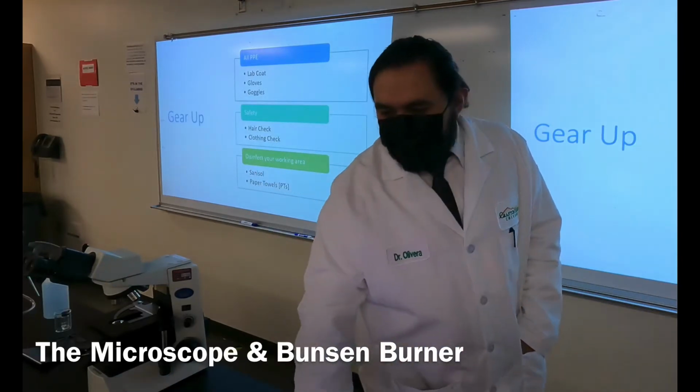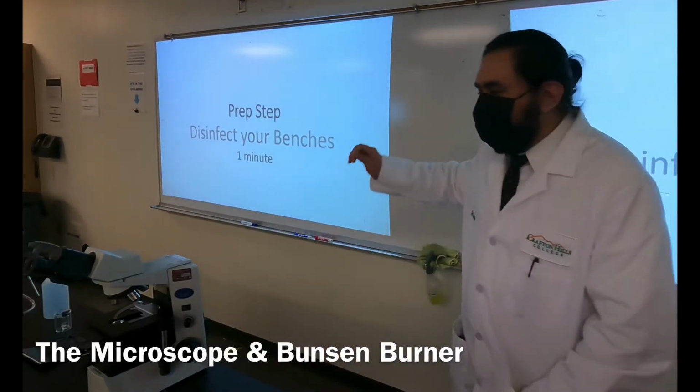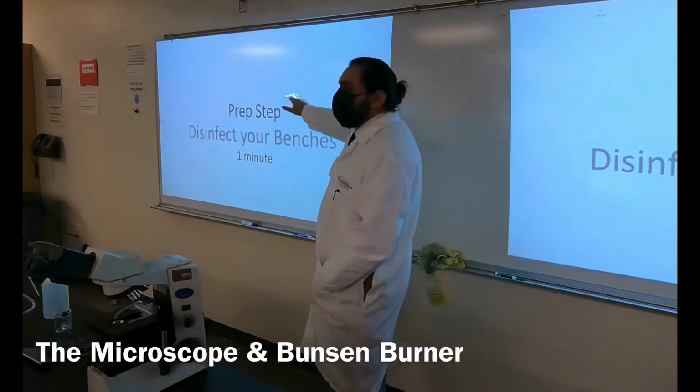All right, so here we are. First step, you're going to see this kind of flashing. All the steps that we have will always be on the screen.